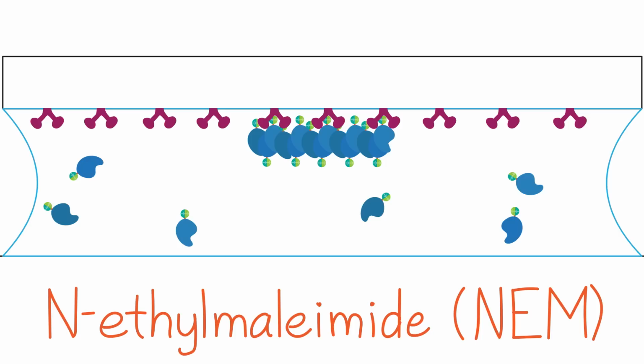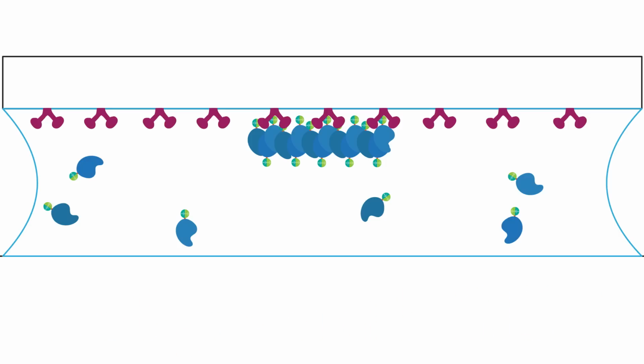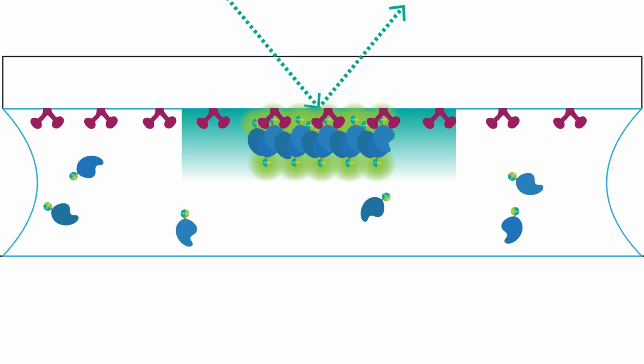Thus, by coating a cover slip with inactivated myosin, you can get the actin filaments that form in solution to stick to the cover slip surface within the 50 to 100 nanometers illuminated by the evanescent wave. The actin monomers diffusing throughout the rest of the chamber, on the other hand, are not illuminated and thus do not fluoresce, greatly reducing your background noise.